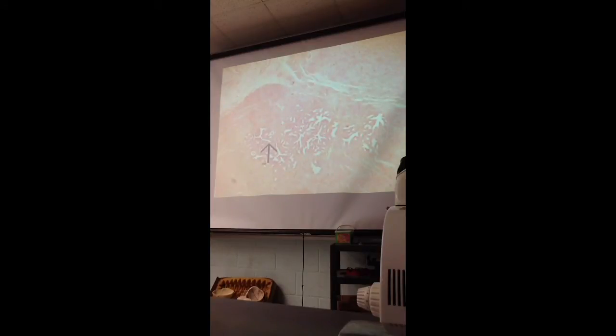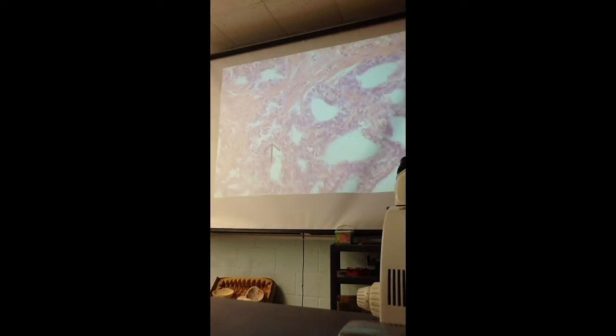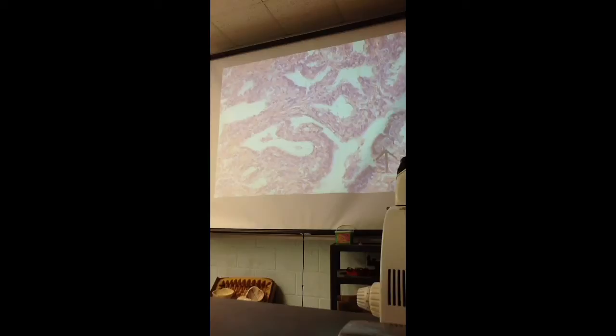So seminal vesicle. And coming to the type of epithelium, again we are on the reproductive side, so pseudostratified columnar epithelium. It's all a single lumen that is thrown into folds. I would imagine seminal vesicles as two glands behind the urinary bladder, like wings of the bladder. Nothing much special regarding this slide.